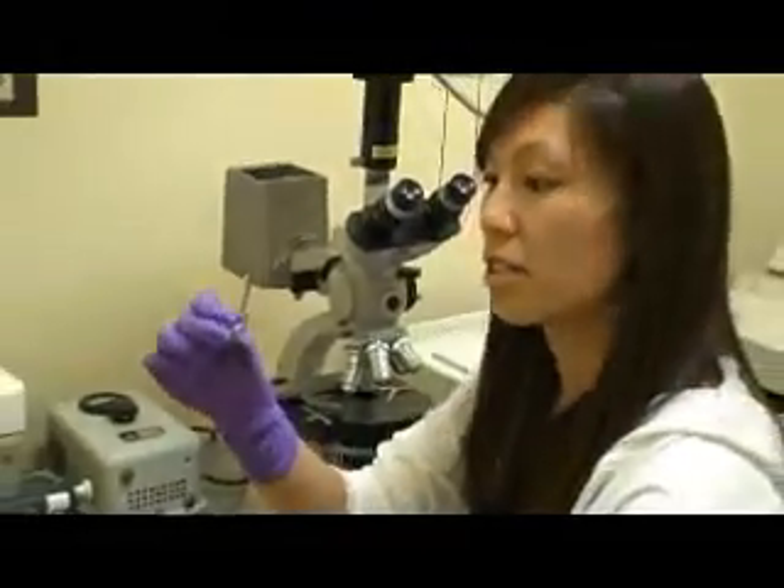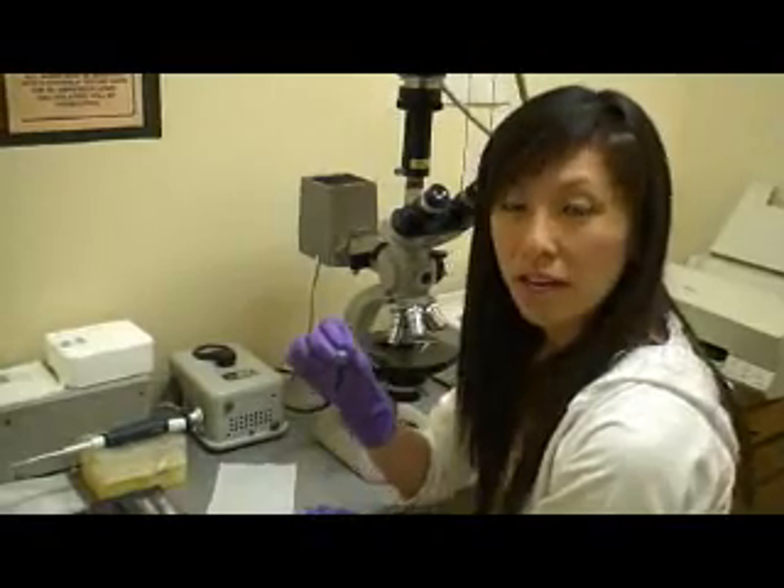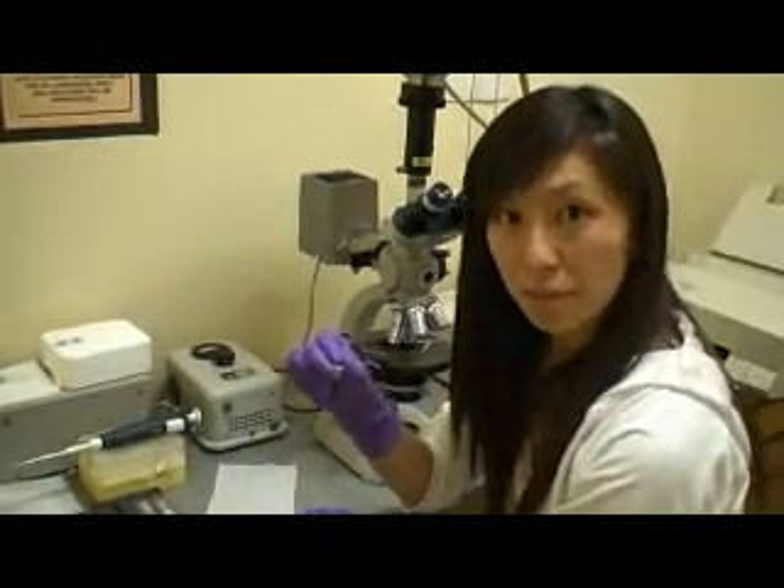Your cell sample should consist of 760 microliters of the medium, 140 microliters of the trypan blue, and 100 microliters of your cell sample.